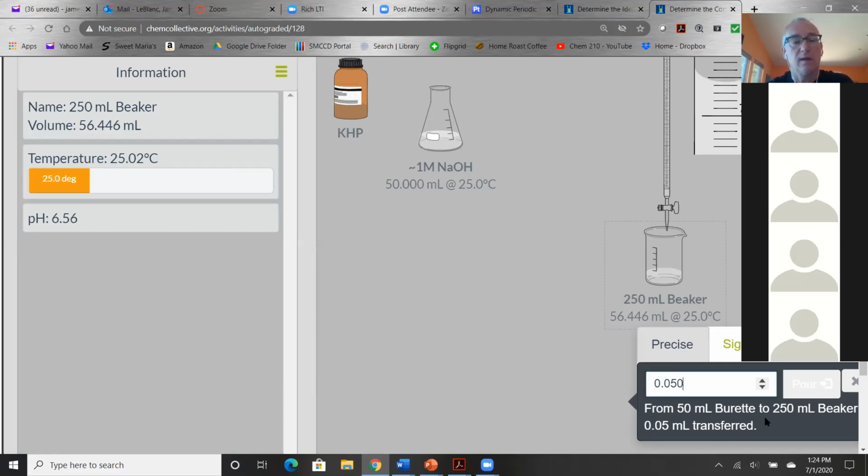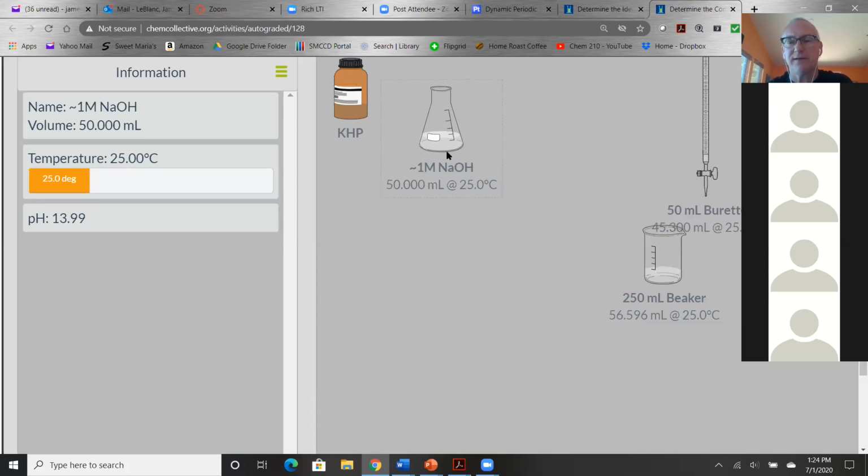Right, 6.5, 6.6. Man, we're getting close. 6.7. Mine turned pink when the pH level is 14.03. Oh, it went way over. How much hydroxide did you add? Same as you. I don't think so. What are you clicking on? Are you holding it on the, because that's the pH of the, oh, damn it. I have to go back. That's the pH of 14, the pH of the hydroxide.